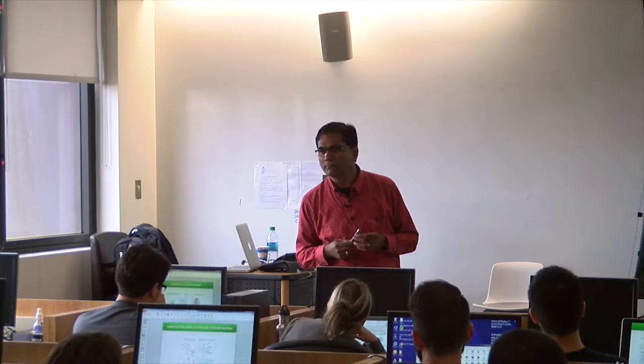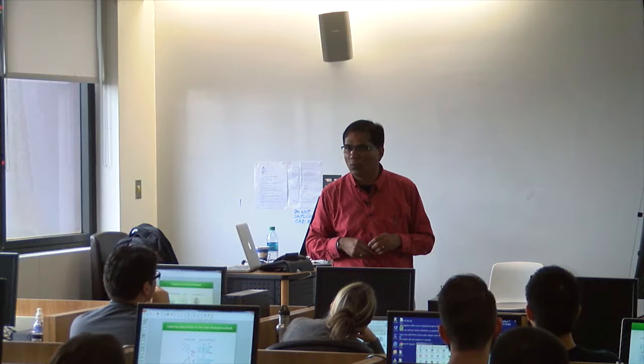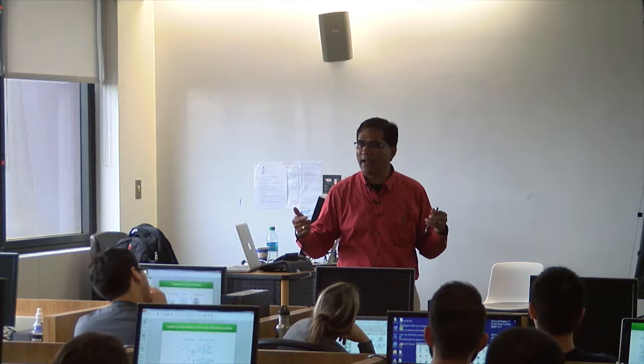Yes, you have to add the adapters. Right, so how do you guarantee that the adapters have been added to every fragment across the entire genome? No, you don't know that. But that's why you do the random shearing of the genome. When you do the random shearing of the genome, then you can add adapters, and it makes sure that the 300 million represents the entire human genome.